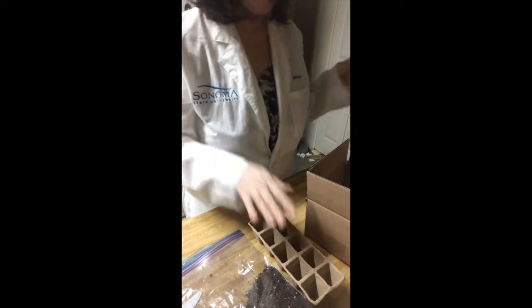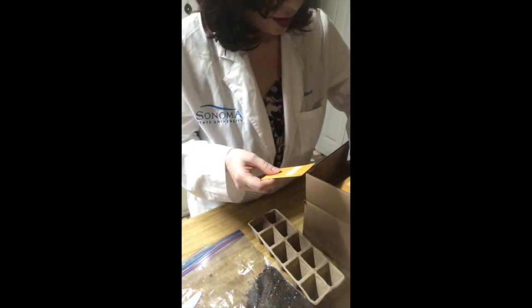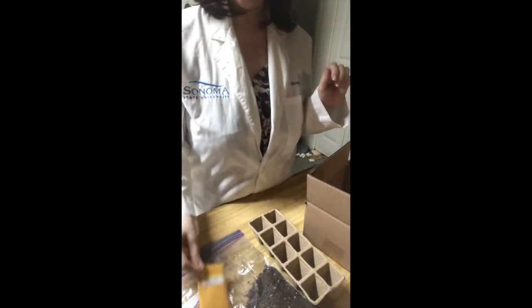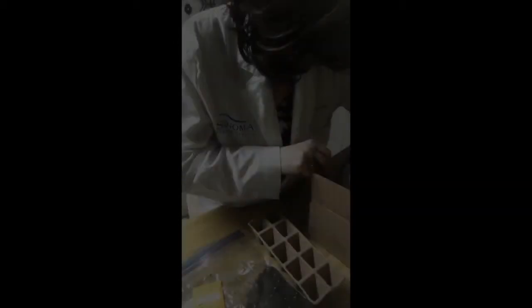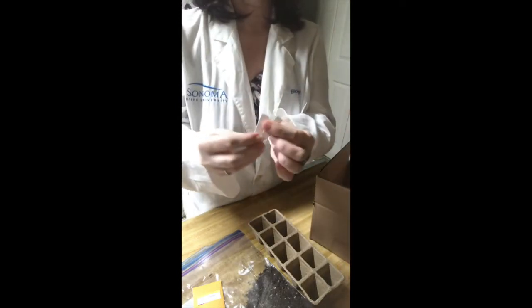We're going to need the bag of soil. You're going to need the flat that has 10 cells in it — those are the pots where we're going to plant our seeds. You're going to want the little bag of seeds; those are basil seeds we're going to be using today. And you're also going to need the plant markers.